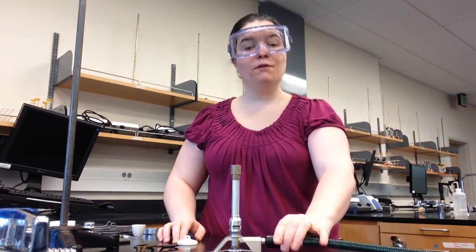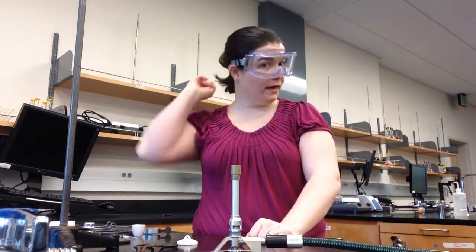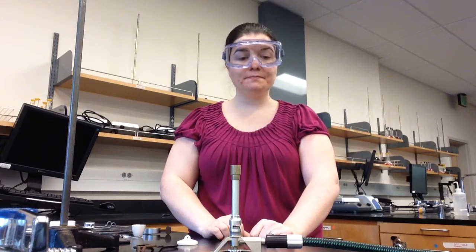In this lab, you will be using a Bunsen burner, and when there is an open flame in the lab, make sure any long hair is tied back and that loose papers have been moved away from the Bunsen burner.